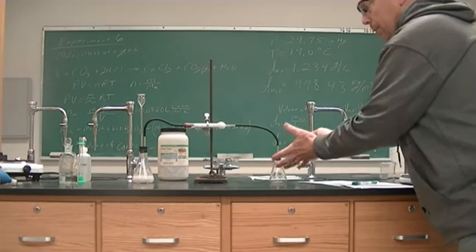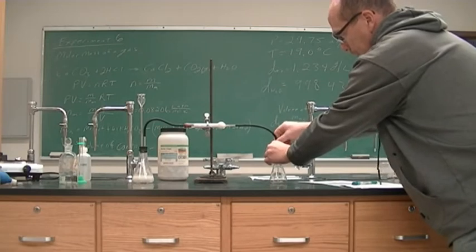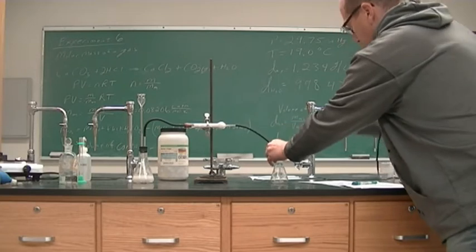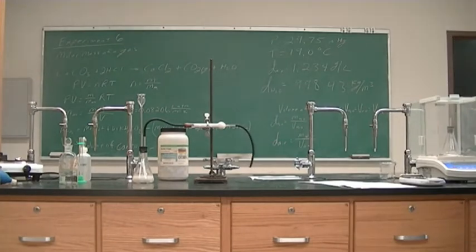I am confident that this is full of CO2 at this point, and so I'm going to disconnect. And then I'm going to put it into my balance, and I'm going to get the mass. 69.1950.